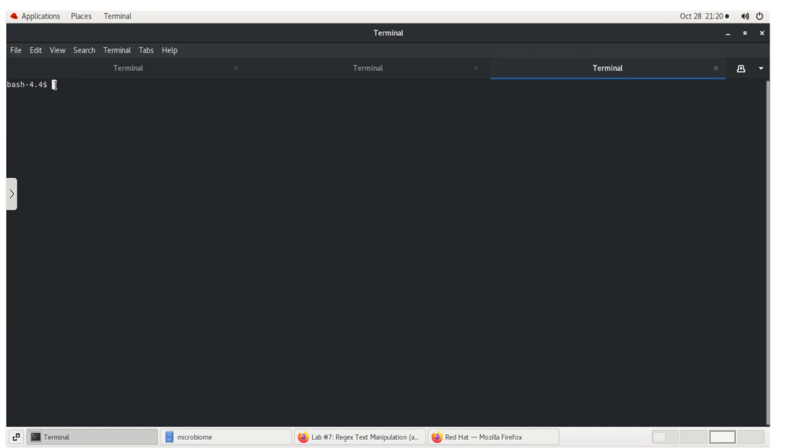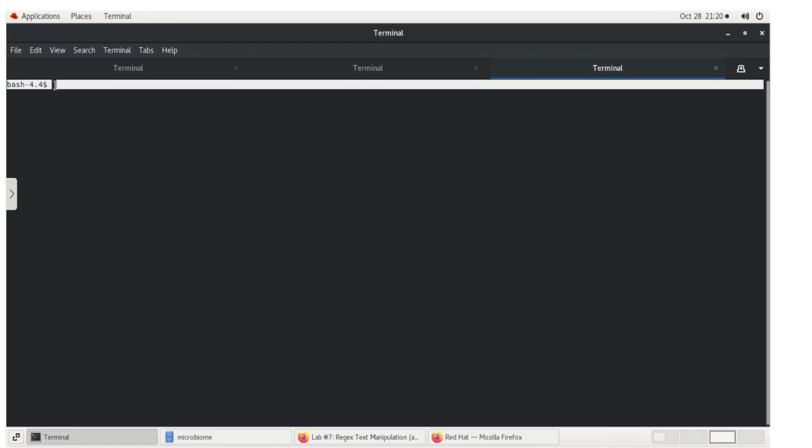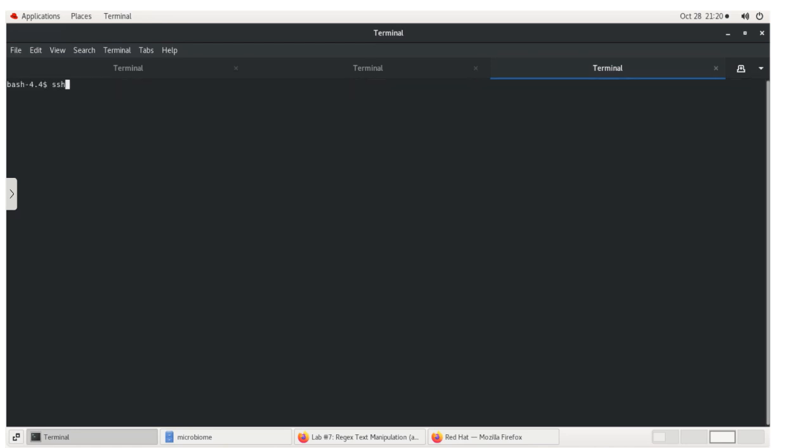So first thing to do is to log in into your supercomputer. You can do it from any remote system like PowerShell or ThinLink. Here I'm using ThinLink, but you can use any other remote server as well. So at first I will be logging into my supercomputer account. So that's what I'm gonna do now.